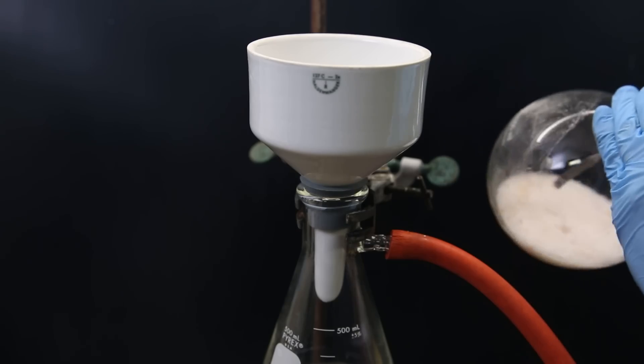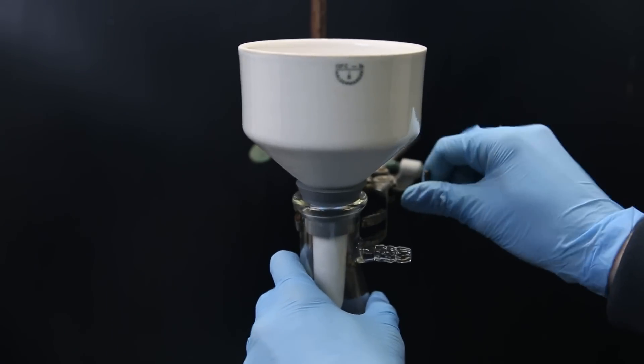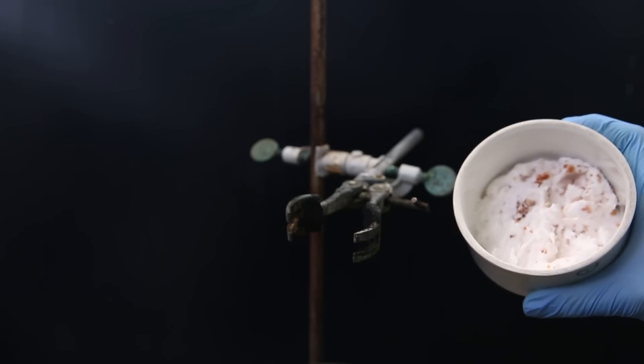Then to collect it, I break it up with a spatula and filter it with vacuum filtration. I wash it with a small amount of water and the product, along with an orange impurity, is left behind on the filter, and it kind of looks like ice cream.